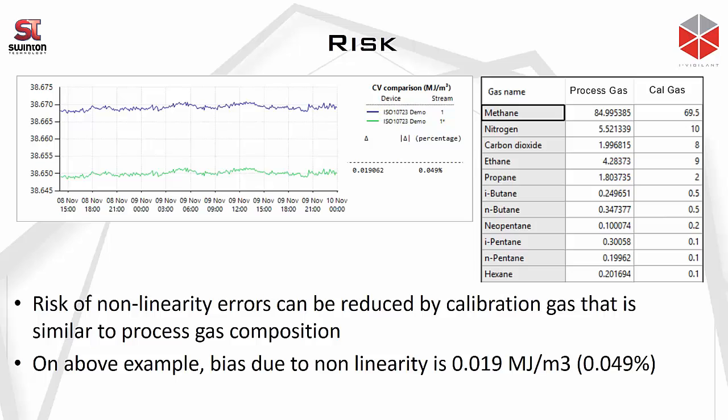The reason I talk about looking into the risk more deeply is that a lot of people don't really have access to the performance evaluation test. So we need to understand the risk. What if we don't do it? If we need to do it, then we need to make a provision to do it pretty much everywhere around the world. But if we don't have the provision for the performance evaluation test, then we need to understand the risk.